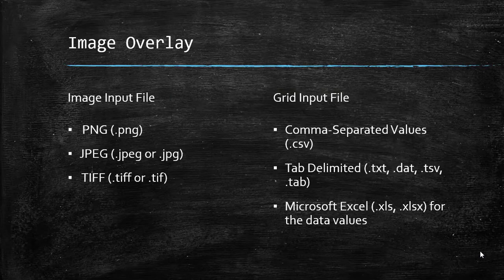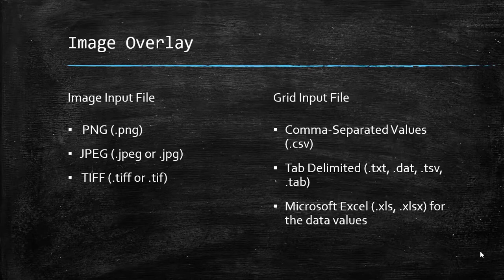The image overlay function takes in comma-separated files, tab-delimited files, and Microsoft Excel files for the data values. For the image, it can take PNG, JPEG, or TIFF file formats.